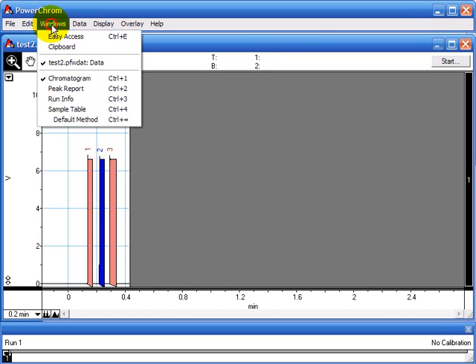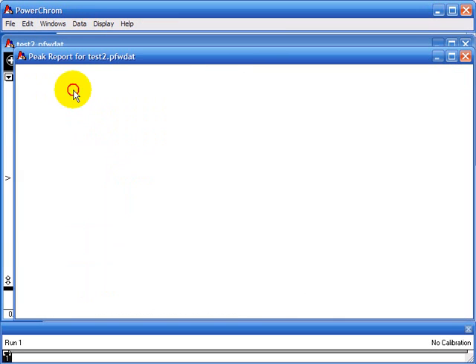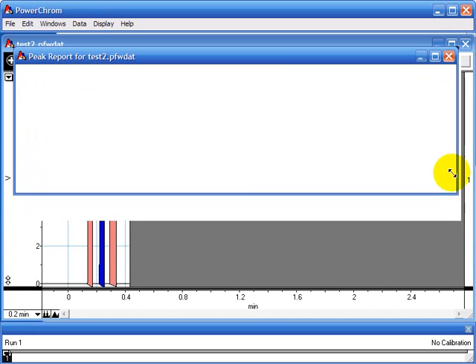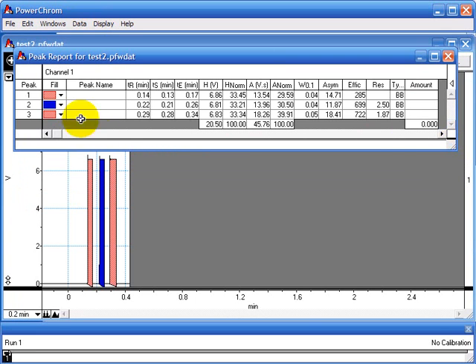Now I'm going to go to data analyze run and the software will integrate those 3 peaks. If I go to window peak report this shows how the software has integrated those 3 peaks.